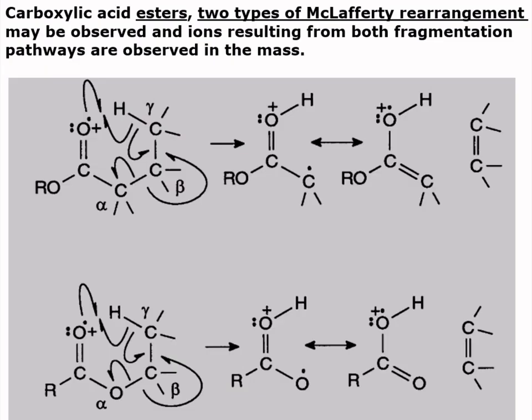In case of esters, there are two ways for fragmentation, either of the alkyl group, in which gamma hydrogen transfer also produces the same results, or in the ester part, the alkoxy group.